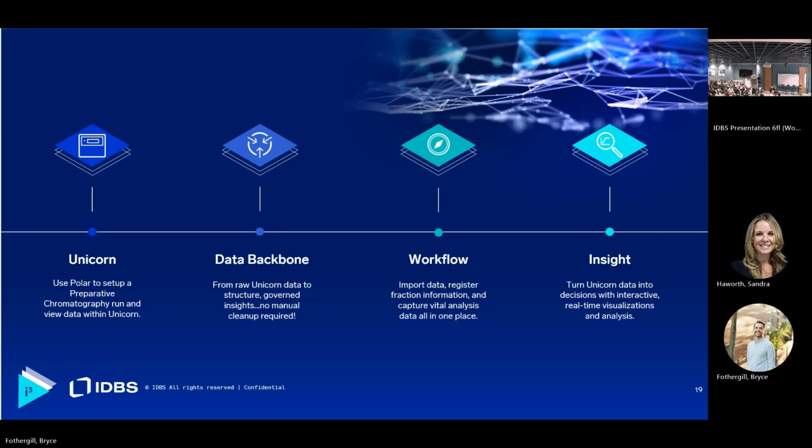And therefore, you can import. Can you export from Insight? Yes, you can. So you can export the data that you're seeing, like throughout that video. All of the underlying data there you can export.